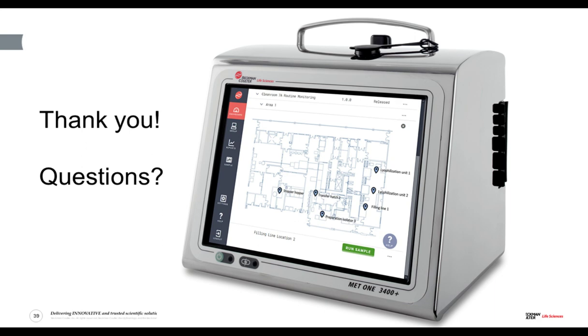Yeah, again, that's a typical challenge that people face because these are typically paper-based. But now all of the SOP version control is done inside the counter using the Clarity software. The technicians only have access to the latest version of the SOP on the counter, and this is controlled by the manager or the administrator who programs the current SOP version into the counter, and they release it for use using their electronic signature, again using Microsoft Active Directory. And so you can verify which SOP version was used, because the SOP name and version number used is recorded in every electronic record that the Clarity software creates.